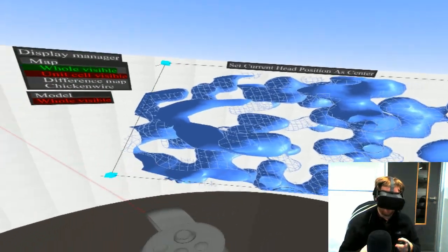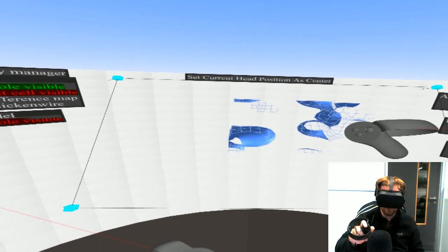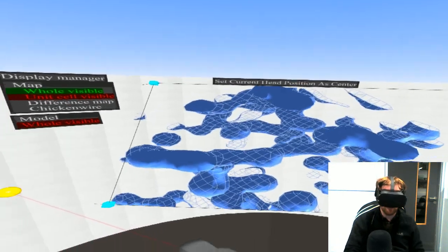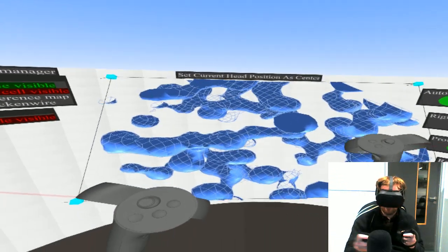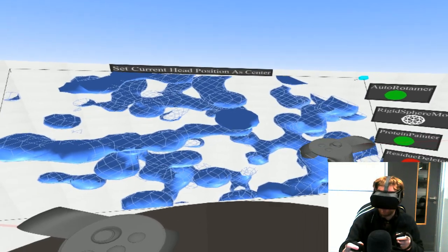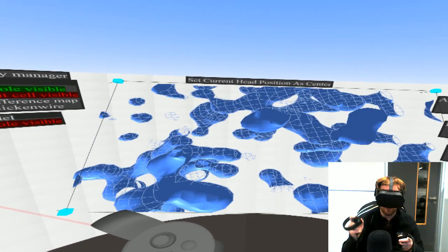As you would expect with a program like this, I can change the contour level of my data, decreasing or increasing the contour level. I can't remember which, but yeah. So very useful to be able to do that. And you might notice that I can move my hand around inside of this. But if I grab with my middle finger, then now I'm sort of moving it towards me, away from it. I can do whatever I like.